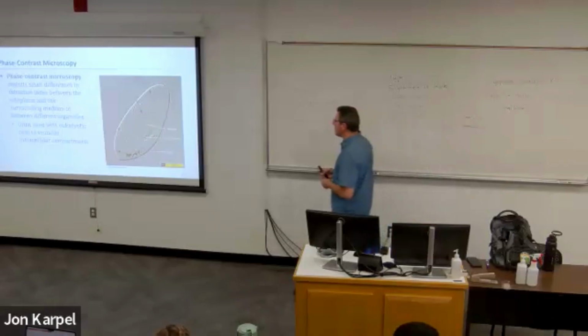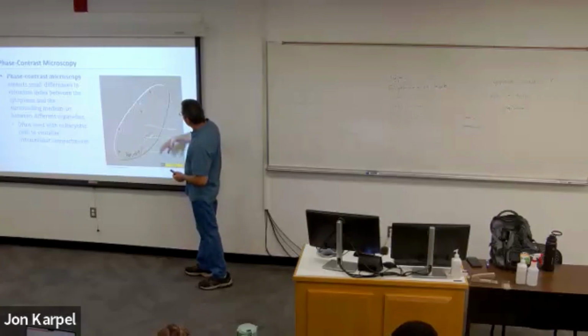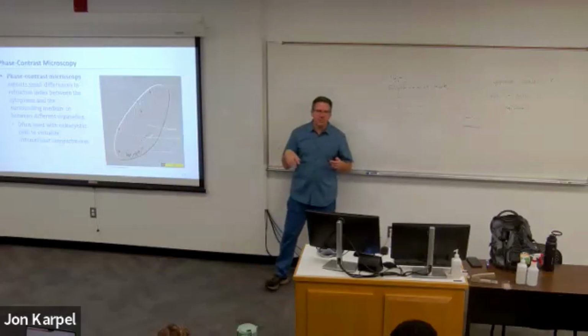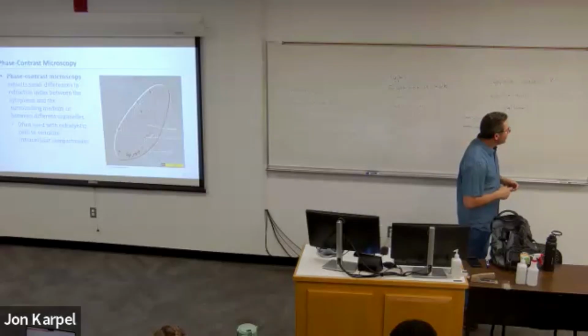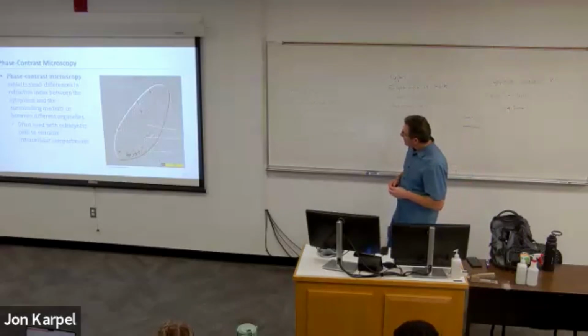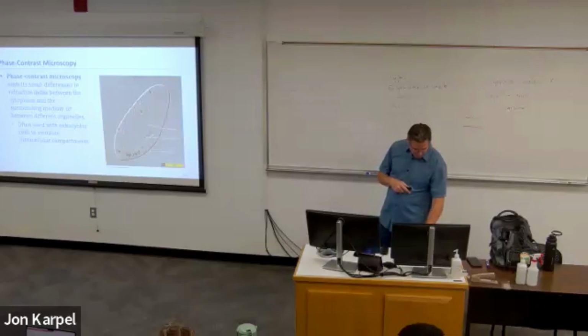Phase contrast is a little trickier because you're working with two different wavelengths. So again, I just focus on the name. Basically, this is used to help us really increase the contrast of whatever sample that we're looking at, okay? So again, I'm not going to test you on this, but you can kind of see what's possible with these kind of samples.